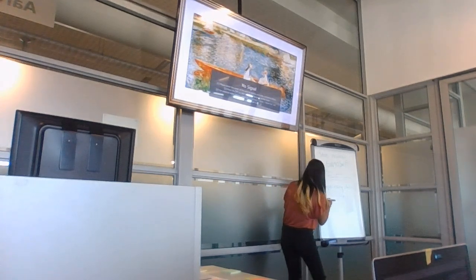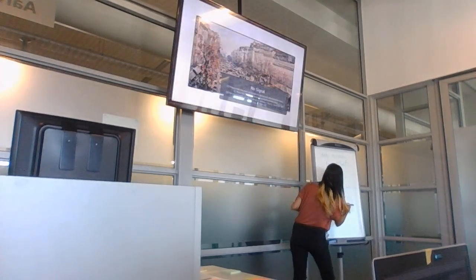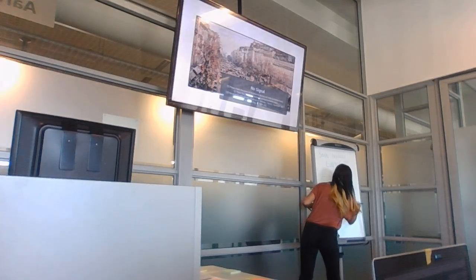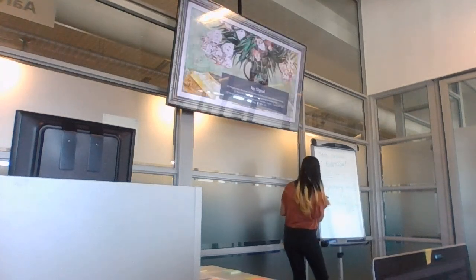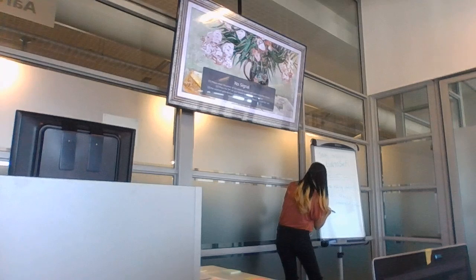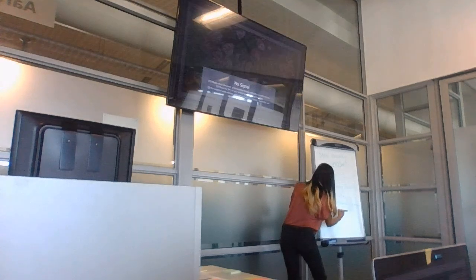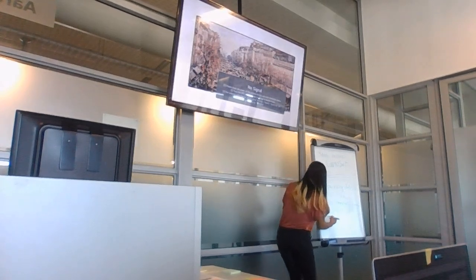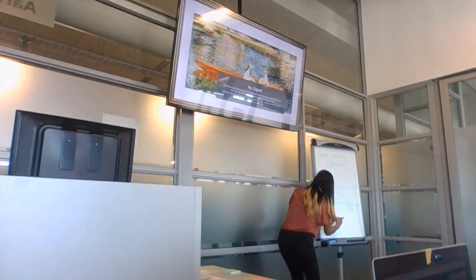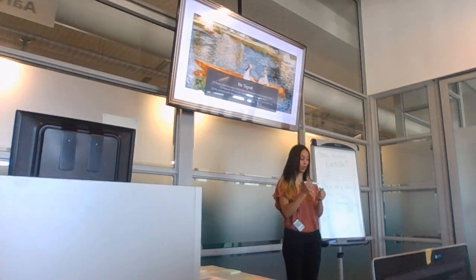Then you get FastP, Trimmomatic, for example, Trim Galore, I don't know what you guys use. Those do pre-processing of your data, so they will clean your data basically. When you are done with FastP on your multiple samples, this goes to MultiQC, and MultiQC will aggregate all of your samples together.